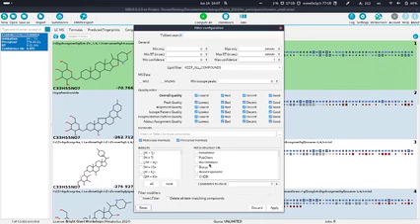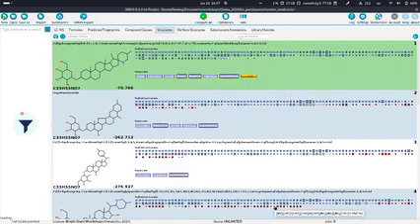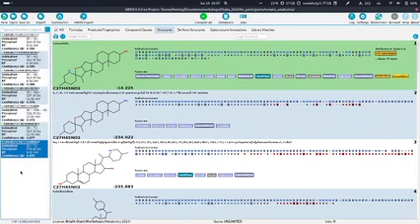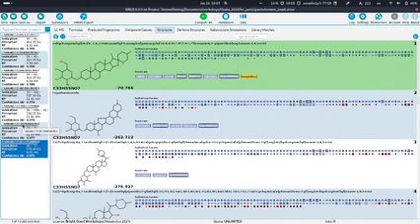Just to show it very quickly, we now have here hit in StructureDB. We have tomatidine, which is the database we just opened. And if we enable this and click on apply, it will now only show us features which have a structure hit which is contained in this custom structure database, which are not a lot because it was also a very small database.